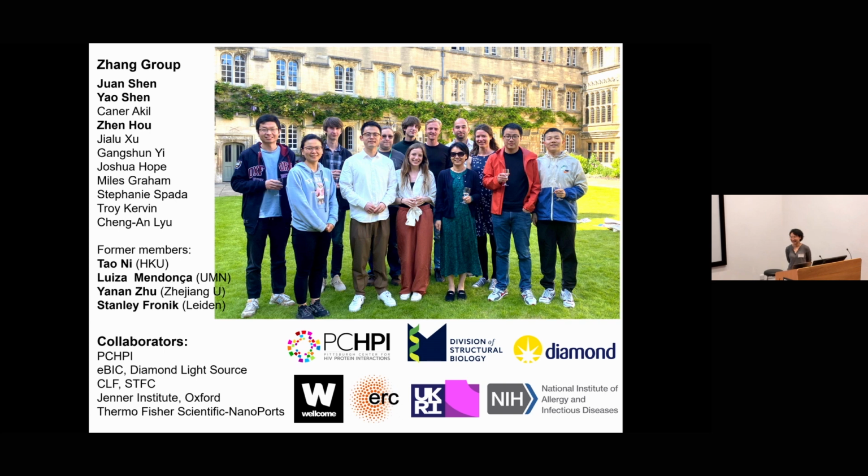So if I got it right, you've shown GFP-labeled integrase. Can you use photobleaching to establish how many integrases you're looking at, or to count the number? Yeah, we counted how many integrases were in there, but we now have a better label. This was done maybe half a year ago. Now we have a direct capsid label using non-natural amino acids with click chemistry. The labels are much more uniform, and it also benefits labeling the capsid instead of integrase.